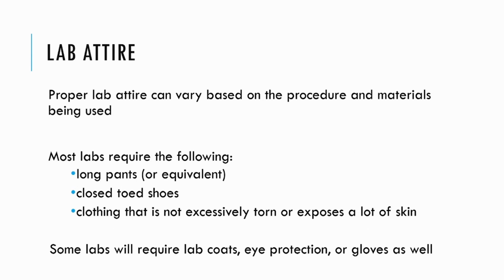When it comes to labs, there's proper attire when it comes to safety. And depending on what the procedures are or what materials you're using in the lab, that attire can be a little bit different. But in general, most labs require the following: long pants or the equivalent, closed-toed shoes, and clothing that is not excessively torn or exposes a lot of skin. The reason being is that when we're dealing with sharp objects and things that can contaminate us, having clothing to protect our skin is going to be more helpful. If something were to spill on you that was dangerous, it's a lot easier to remove the clothing, and with the clothing comes the contamination, than to try to fix the contamination directly on your skin. So it's not because we want to be prudes or anything, or control what you wear. It's just we want you to be safe.